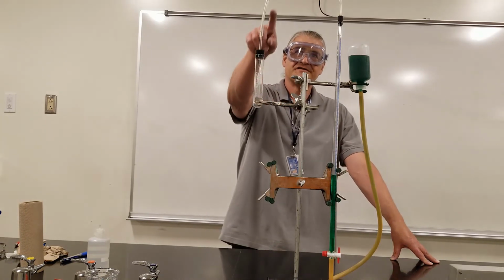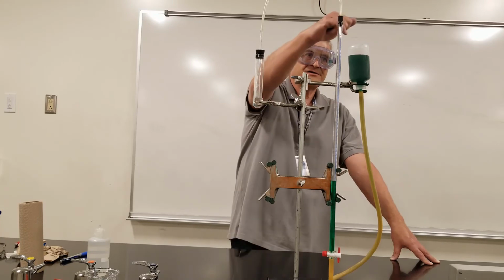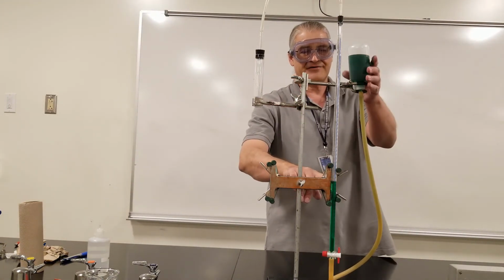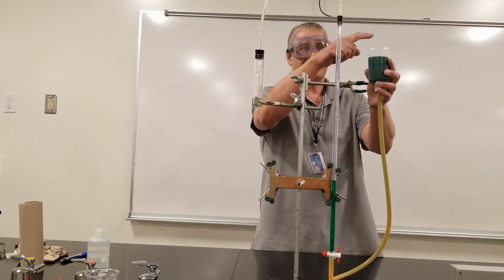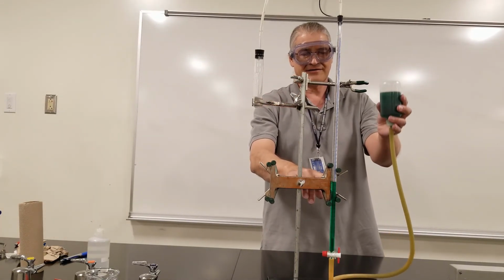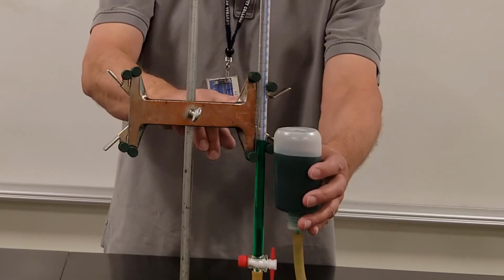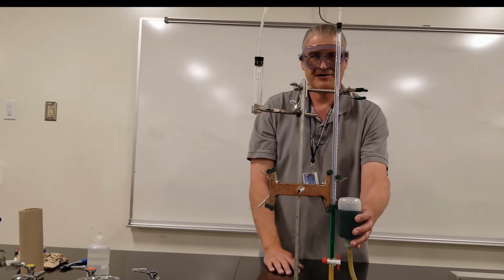So you can see the pressure in this end of the system right now, the closed end of the system, is higher than the pressure here. That's what's pushing that liquid down. Now, I can't really take this reading as is. I have to level it first. Again, when I level it, that's adjusting this pressure to be the same as this pressure. Watch how much that water level changes as I go to level it. Do you see how it makes quite a bit of difference with the leveling bulb? It changes the volume by several milliliters. And that would be my final volume right there.